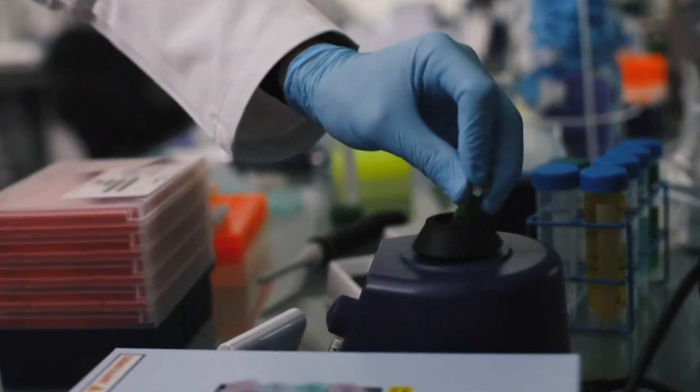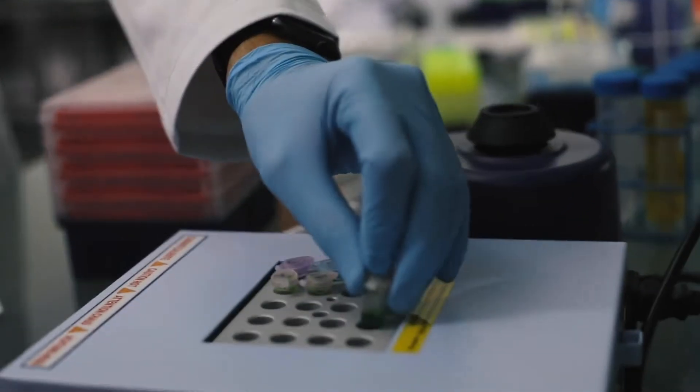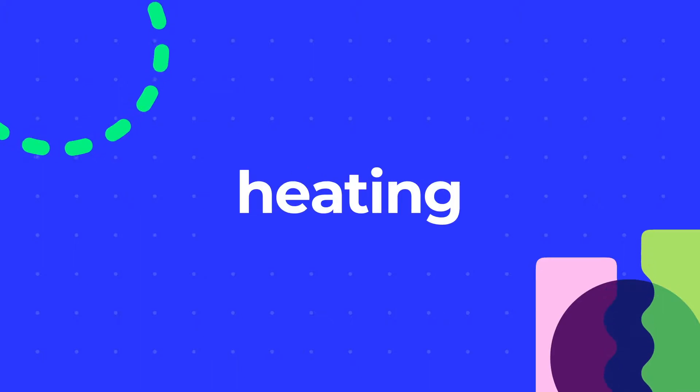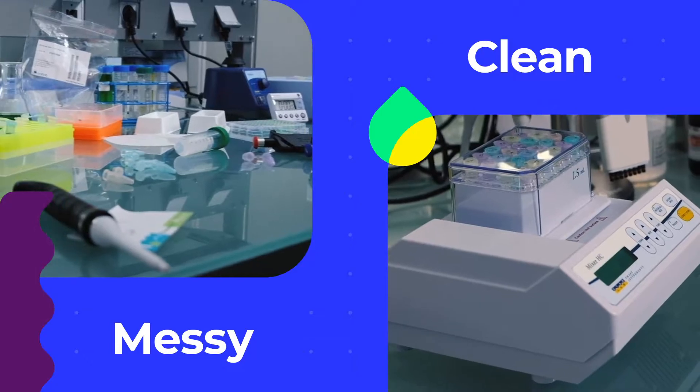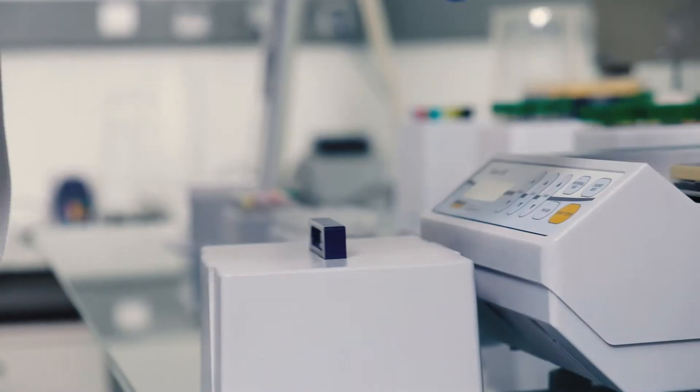Previously, you needed a whole bunch of products to cover your mixing and heating needs. Our Mixer HC combines all of these into one convenient unit for a tidy, more organized workspace, saving you time by giving you options.